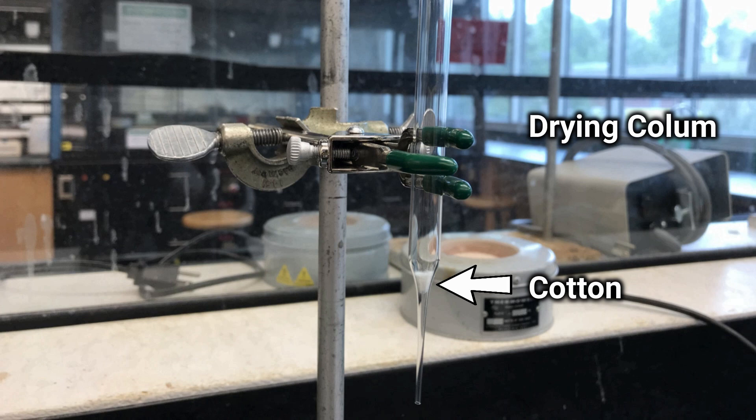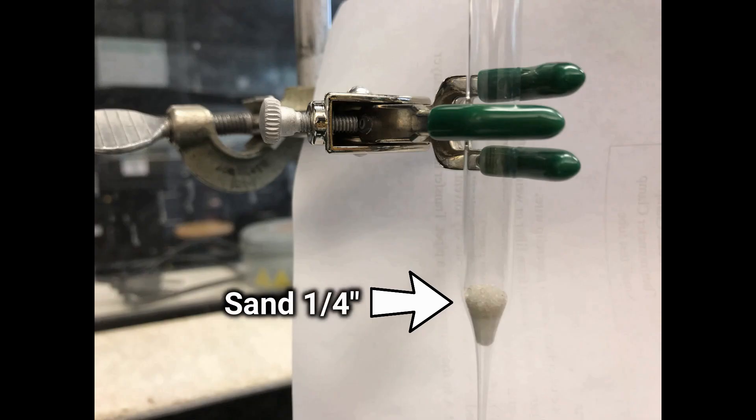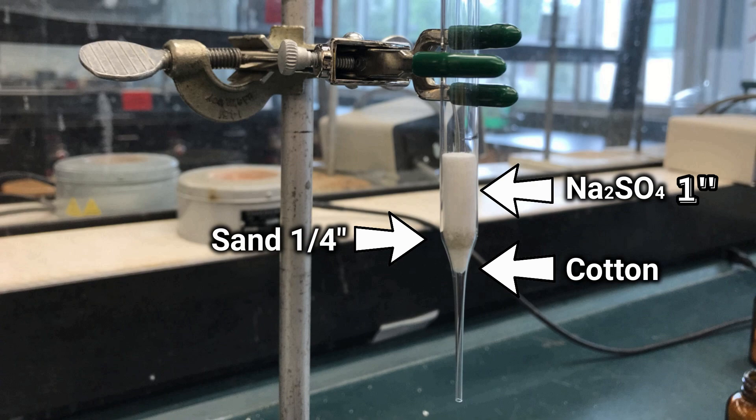Place a small piece of cotton at the end of the pipette. Use a paper clip to push it to the bottom. Next, add about a quarter inch of sand. Make sure to keep the sand level, followed by 1 inch of sodium sulfate.